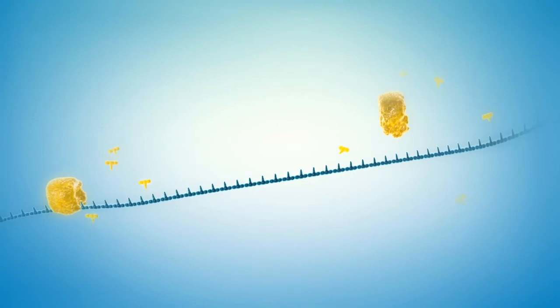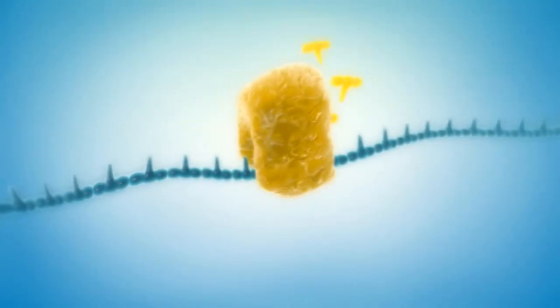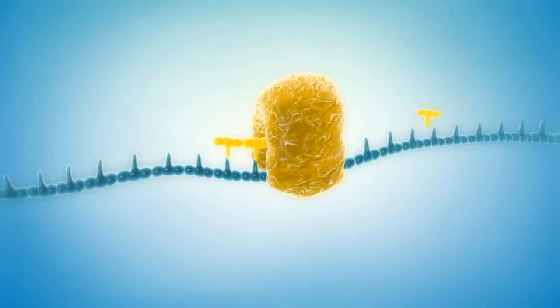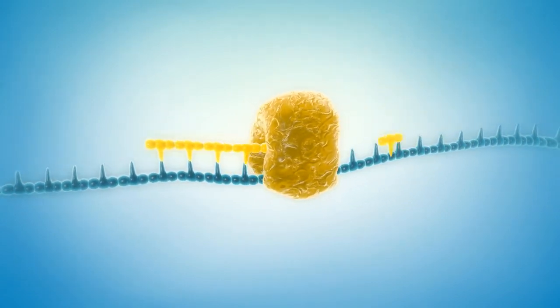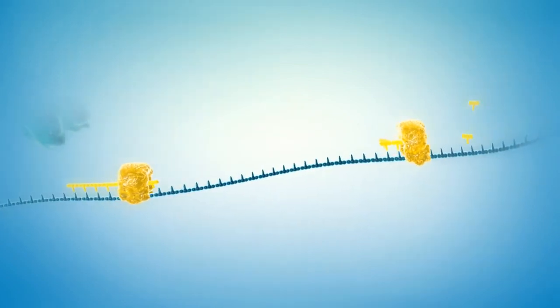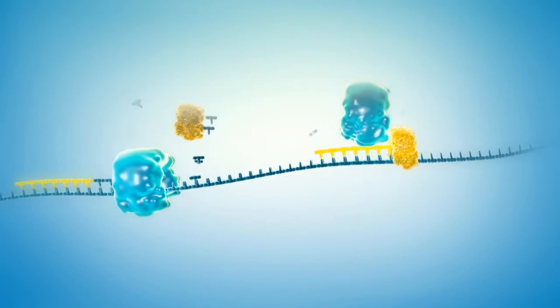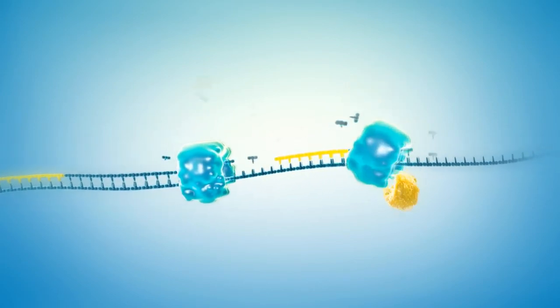Primpol binds denatured DNA at different recognition sites and synthesizes small fragments of DNA that will act as primers for Phi29 DNA polymerase. Once the primers are long enough, Phi29 DNA polymerase displaces Primpol and starts DNA polymerization using these primers.